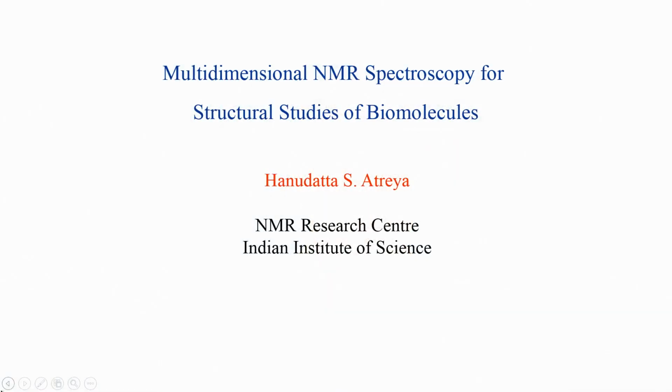Hello everyone, this is an introduction to the new course in NMR spectroscopy, titled Multidimensional NMR Spectroscopy for Structural Studies of Biomolecules. In this course we will build on the basics which we have learned in the previous course and go beyond 1 dimension and 2 dimension NMR and look at 3D NMR and its applications to studying structures of biomolecules such as proteins and nucleic acids.